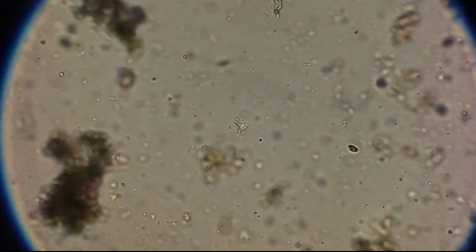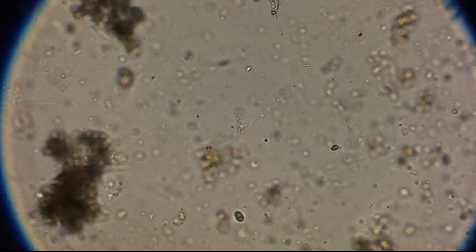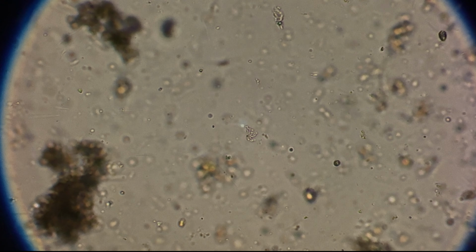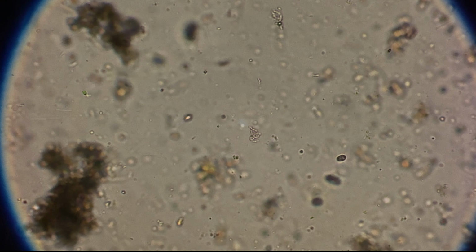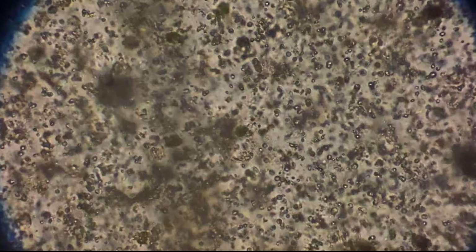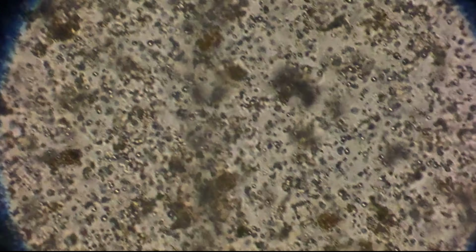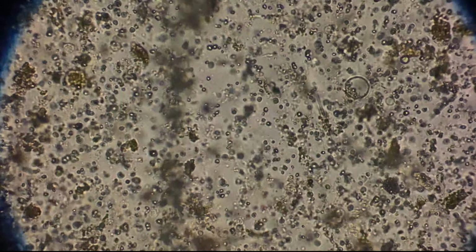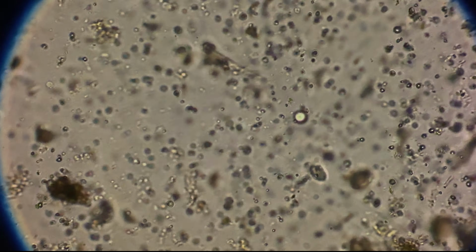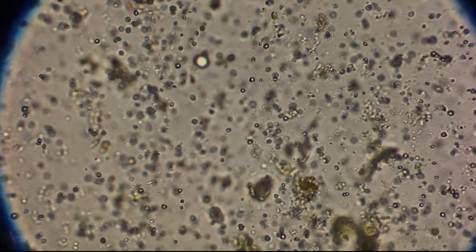Let's keep watching. Right here, this one is still moving pretty fast, almost like it hasn't noticed anything's wrong yet. But over here, completely still. That's the kind of contrast that keeps this footage so oddly hypnotic. Some organisms clinging to motion, others just stopping. Now let's slow things down and actually talk about why this might be happening.